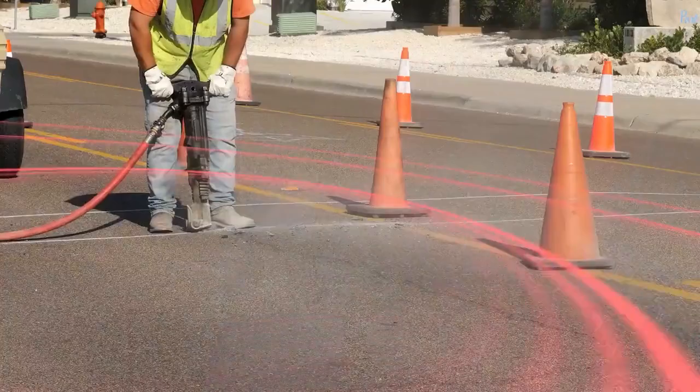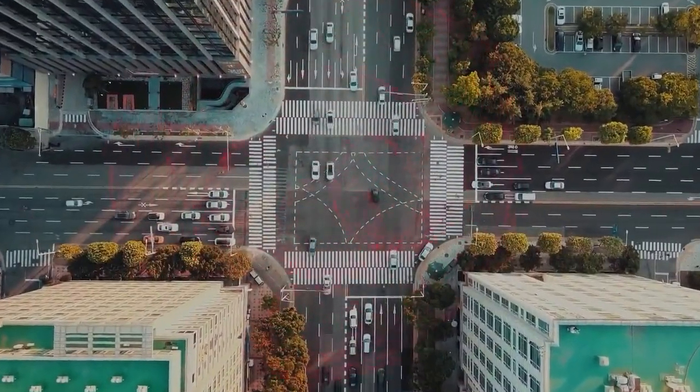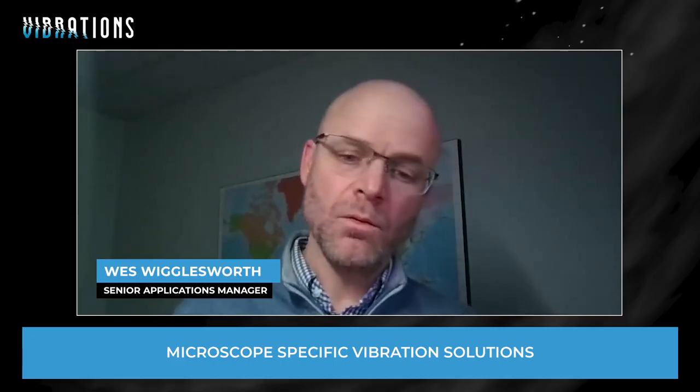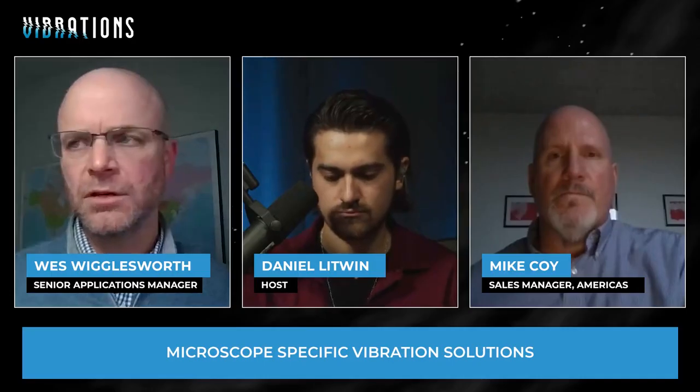But as the building is populated with other instruments, HVAC certainly impacts the vibration of the building and the noise in the building. And certainly these things are considered in the design phase, but we see it all the time. And there have been published studies about vibration levels in the as-built phase, and then when it's populated and mature, the vibration levels increase.